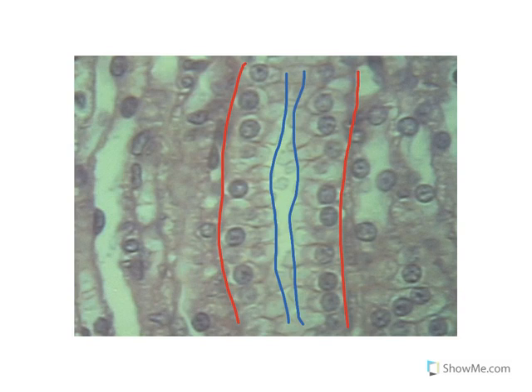And we can see two individual ones. If I use green, here's one cell and another cell. Here's a cell and another cell. Here's a cell and another cell.